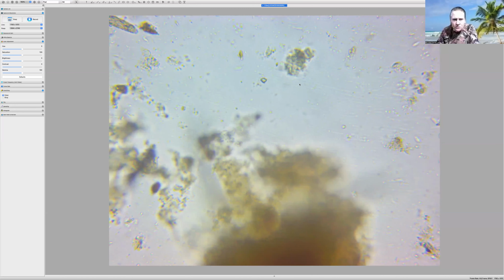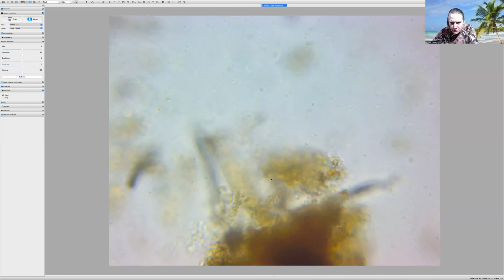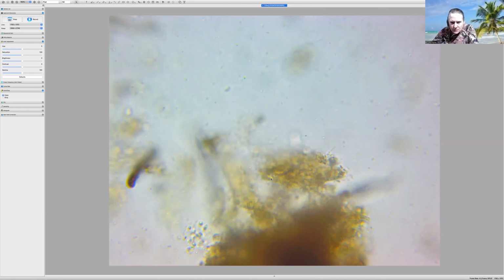Okay. Do you see this aggregate? And you're not going to see her, but do you see this? Sorry, I'm trying to point to it with my hand. This here water movement. There is a stalk ciliate in here. She's probably on the back side. Let's see if we can see her on the front side. Where is she? She is moving a lot of material though. Okay. That's not her there. She's off to the side. So we're not going to be able to focus on her because she is behind this aggregate.